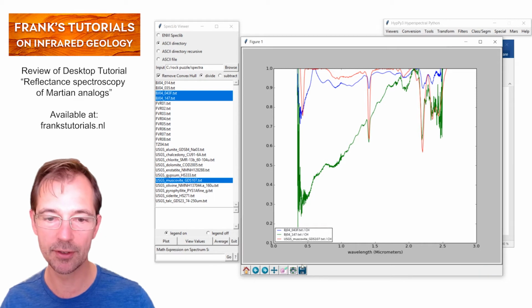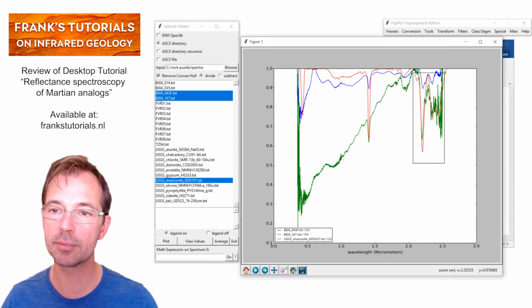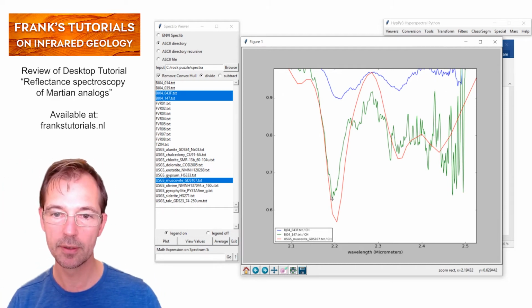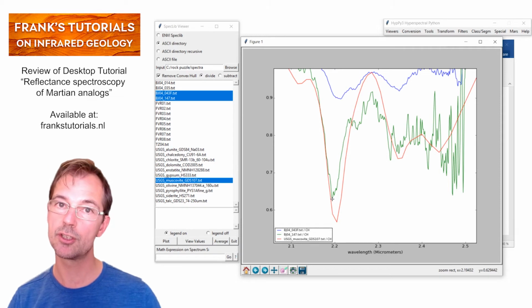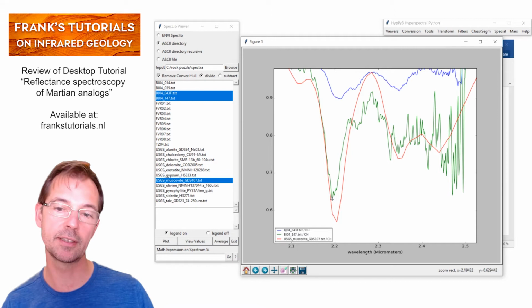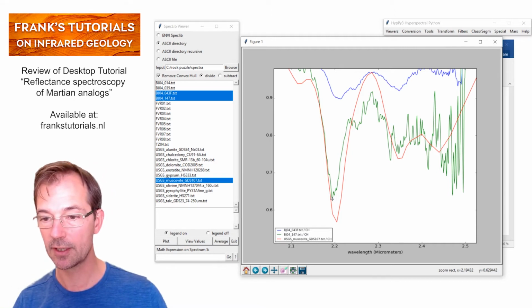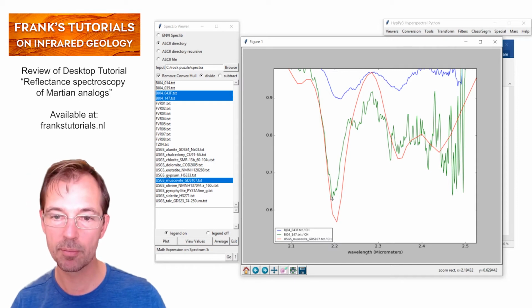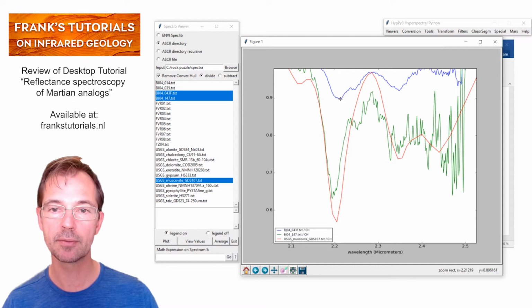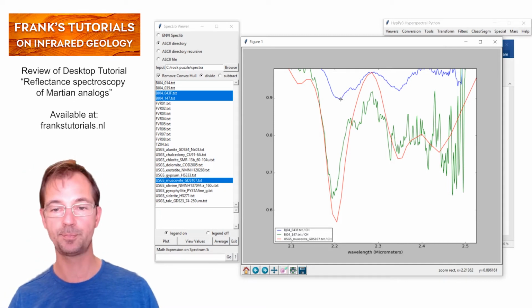But we want to differentiate between the two different rock types based on the wavelength position. And then we see this. The green rock has a wavelength position which is shorter, which means that the aluminium content of the muscovite is higher, at 2194 approximately. And the other unknown spectrum is longer, at 2213, 12 more or less.